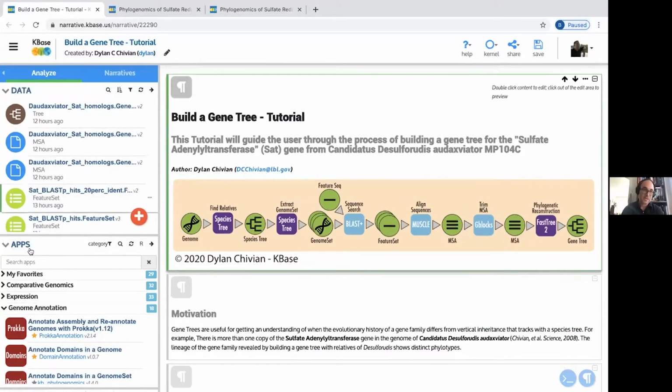There's data objects and there's apps. And so here is an abstraction of the sequence of steps in this narrative notebook, where a data object I've got represented as a circle and an app as a rounded square. And so you can sort of imagine that analysis steps, these app runs, are sort of taking some data and turning it into a different type of data, and it's connected, and then outputting visualizations and so on. But it's a lot of object type, data type transformations in a sense.